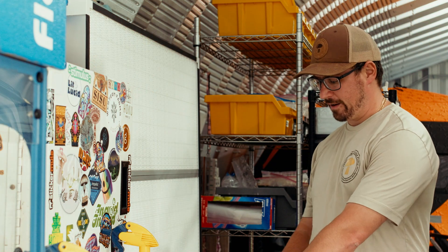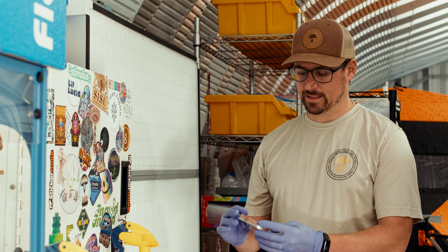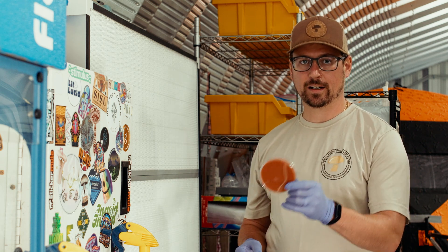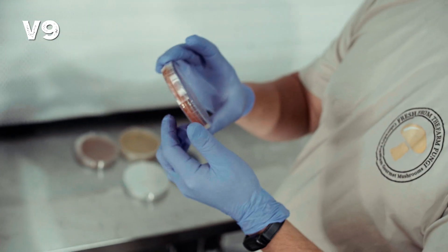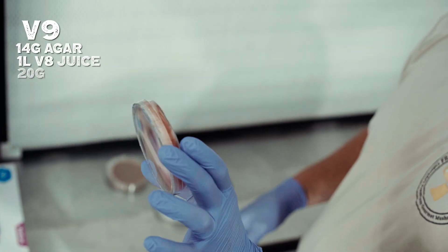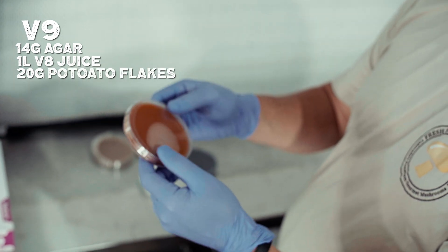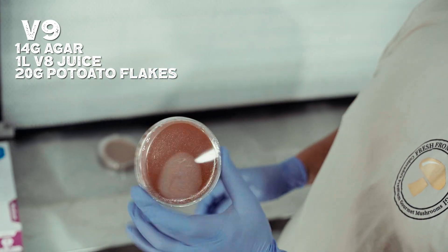I've got five different agar recipes laid out, so I'll just go through them and what they're comprised of. The first one is this V9 agar. It's an orangish color and it's made up of 14 grams of agar, one liter of V8 juice, and 20 grams of potato flakes.